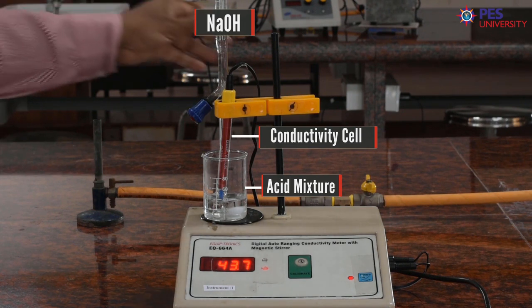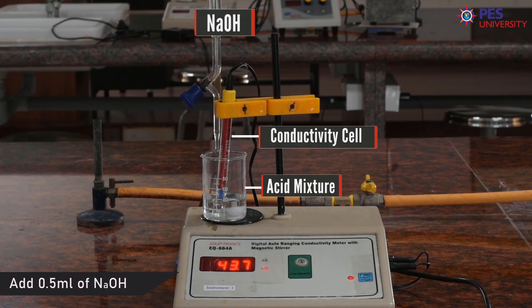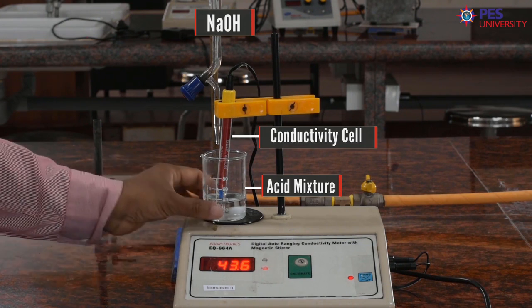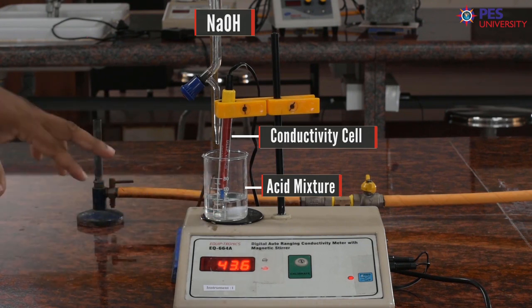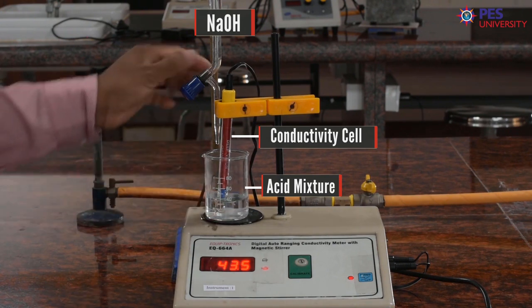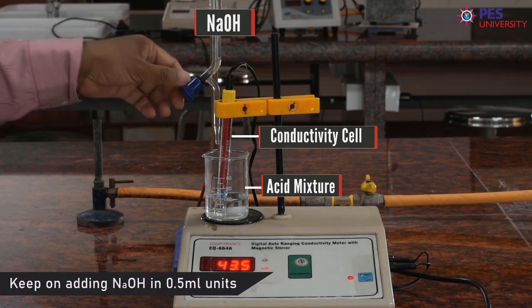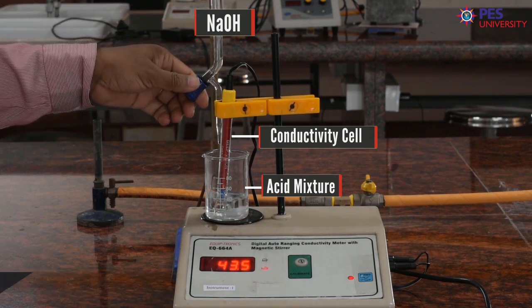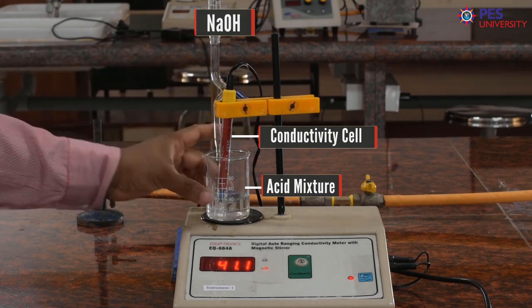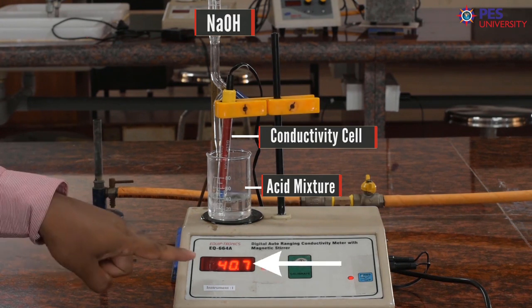Then add 0.5 ml of NaOH from the burette. Actually the stirrer is already on, so you have to make sure that you are mixing the solution properly. After that, add 0.5 ml of NaOH. Then continue the stirring for about 20 seconds. Then note down the change in conductance values.